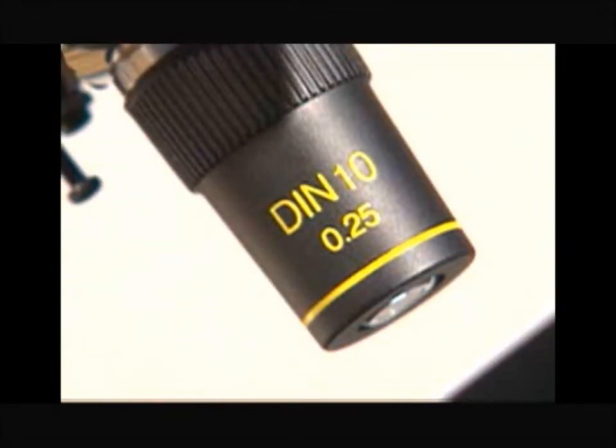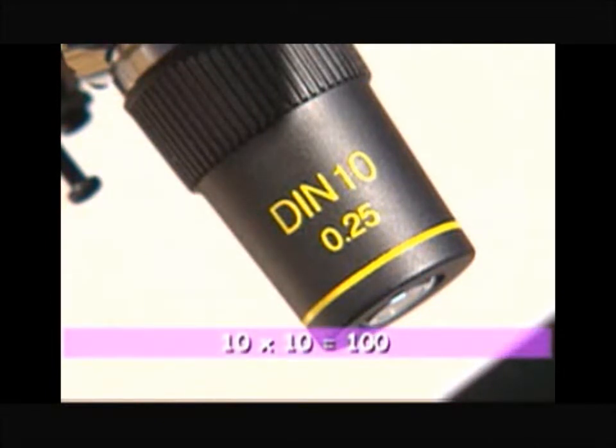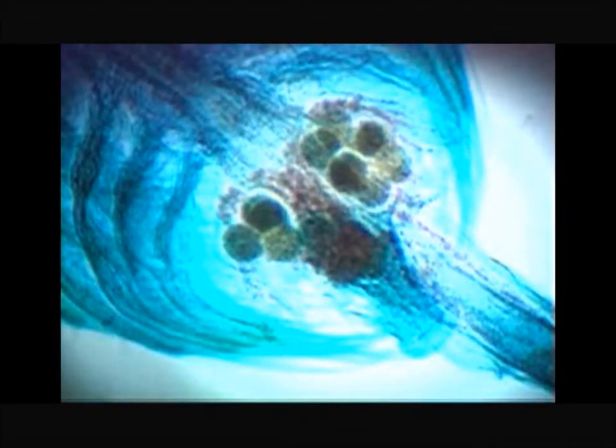When you combine a 10-power eyepiece with a 10-power objective, the overall magnification becomes 100. This is the brine shrimp magnified 100 times. Now we can see details we weren't able to see before. These are its eggs.